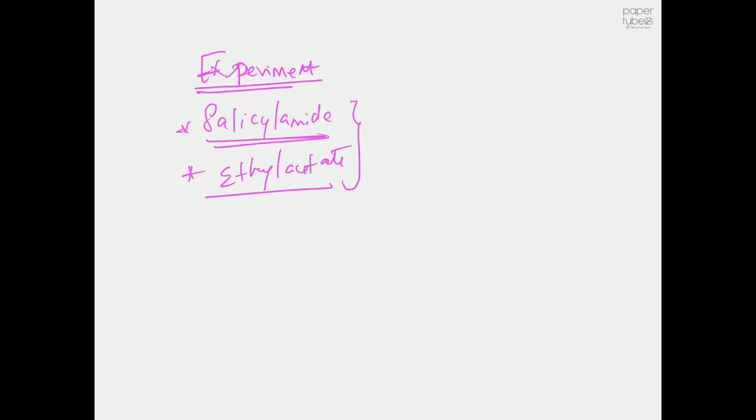So we are going to perform the nucleation experiment, everything at 15 degrees centigrade. And then the solubility of salicylamide at this particular temperature is equal to around 2.23 grams per 20 milliliters. So this is your solubility limit at 15 degrees centigrade.